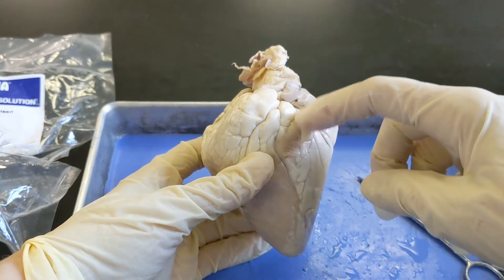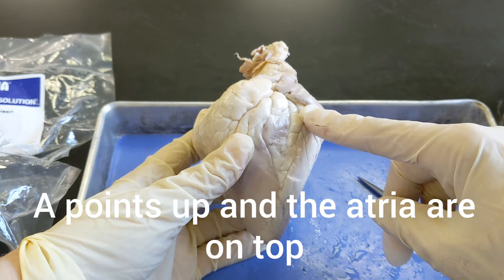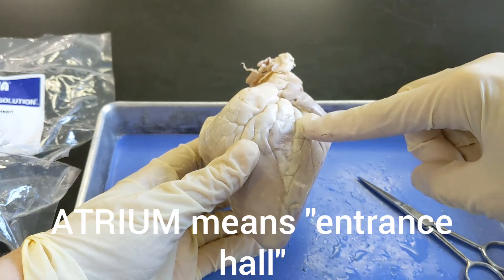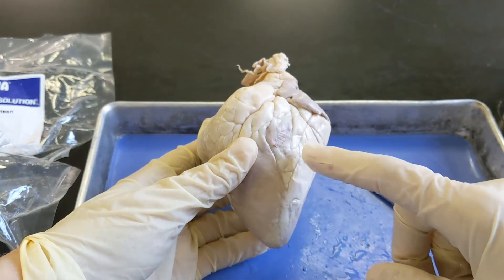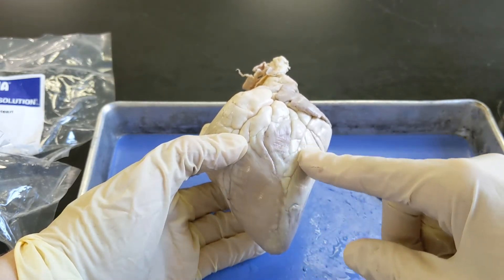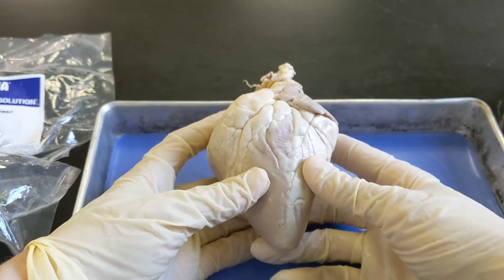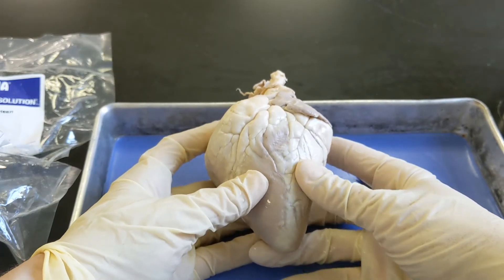I always remember that A is for atrium and the letter A points up, so the atria are at the top. If you think about a building, the atrium is the entrance hall — atria means entrance, so that's where the blood comes in. This is our left atrium, and this is our right atrium. I remember that V's point down and V is for ventricle, so the ventricles are at the bottom. This is where our left ventricle is — you might even be able to push and feel a little bit of an opening. And this is the right ventricle; I may be feeling a little hollowness here.